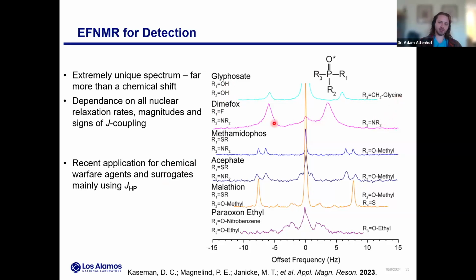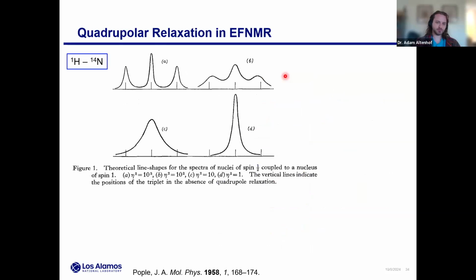And you can see as he puts on many different sorts of ligands, in every case we get a very unique Earth's field spectrum, and a very nice resolution. And this is your sample differentiation and characterization. It's not really necessary to even have a chemical shift in this case if you're just trying to tell what's what, or do the threat detection ultimately of something like sarin.